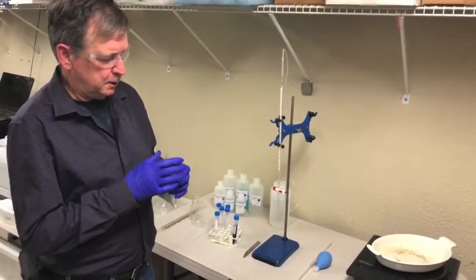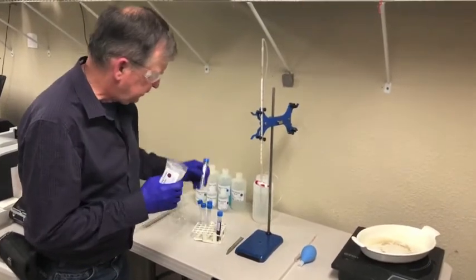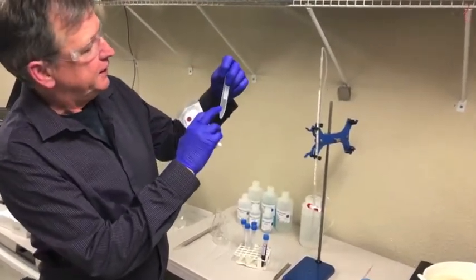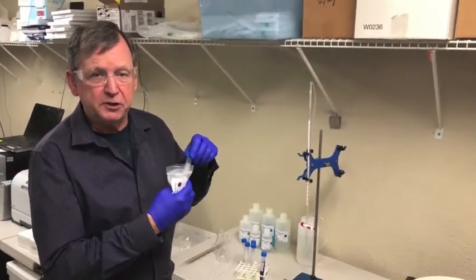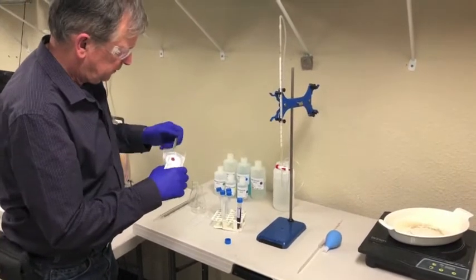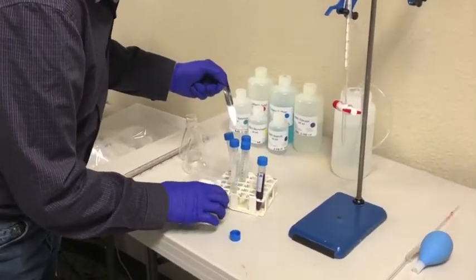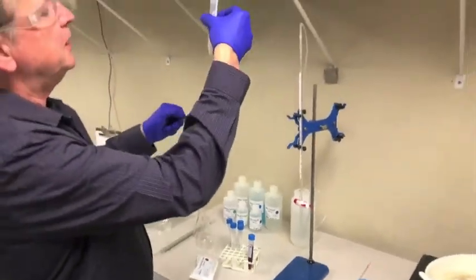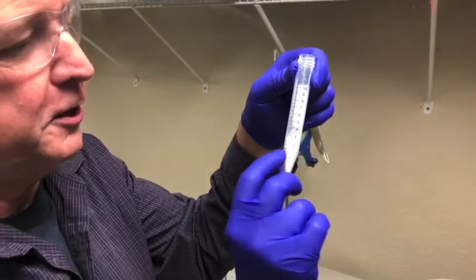We would normally suggest you weigh out the powder, but we're going to estimate it by volume. I'm going to take a 15-milliliter conical tube provided in the kit and fill it to about the two and a half milliliter level on the striations with this white powder. It's kind of fluffy, so be careful. The amount I put in brings it up to about the two and a half milliliter level — that's all the accuracy you need for this step.